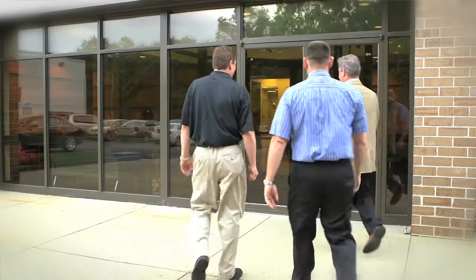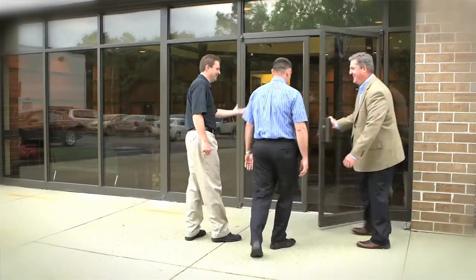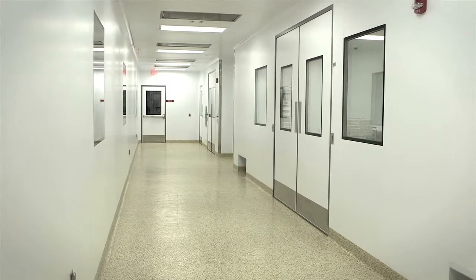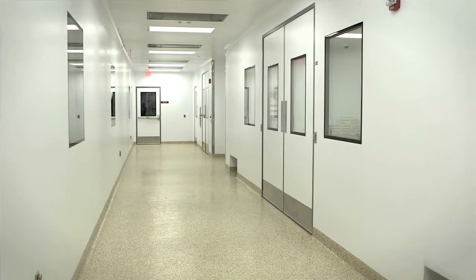Over my 13 years here at the facility at DPT Lakewood, we've undergone quite a transformation. We originally were a non-sterile liquid and semi-solid manufacturer, and we transformed ourselves into a center for sterile and specialty products.